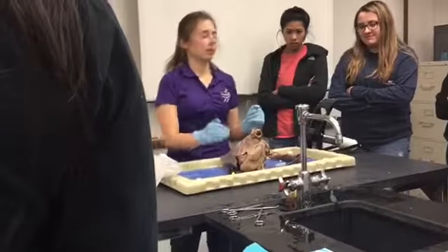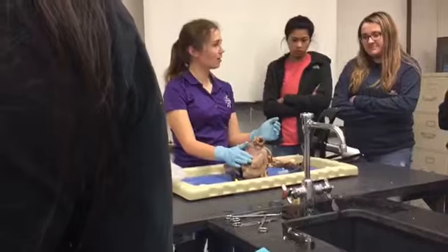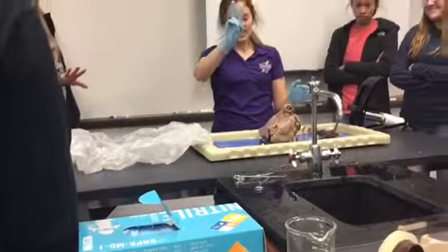Which one is the right lung? Number one or number two? One is the right lung. Yeah, right. Okay, you might want to wash your hands.